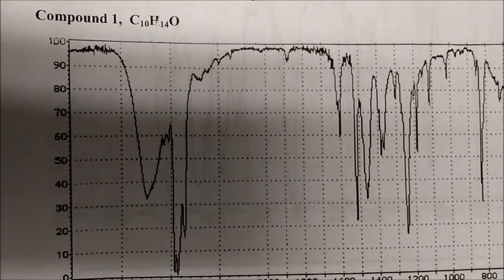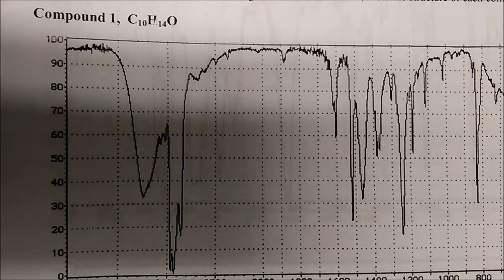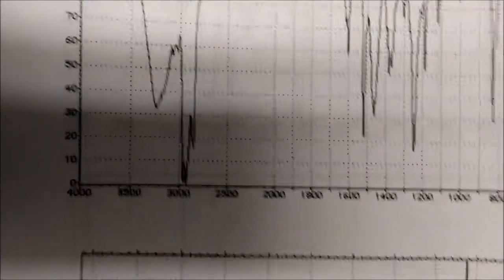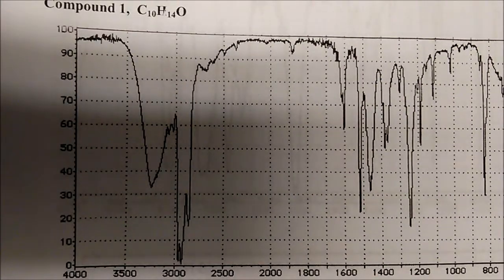Now, let's jump straight into some examples, because it's much easier for me to sit here and tell you what to do, but you don't actually see it until you start practicing problems for yourself. My idea here is to give you a concept and a general way of thinking of how I look at these problems when I'm trying to solve them.